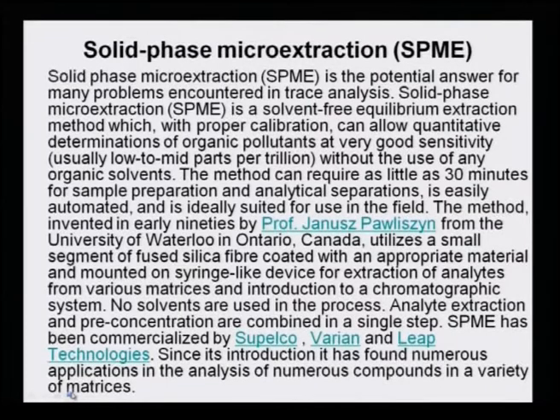It utilizes a small segment of fused-silica fiber coated with an appropriate material and mounted on a syringe-like device for extraction of analyte from various matrices and introduction to a chromatographic system. No solvent is used in this process, and so it is truly a solid phase microextraction, as the name suggests.